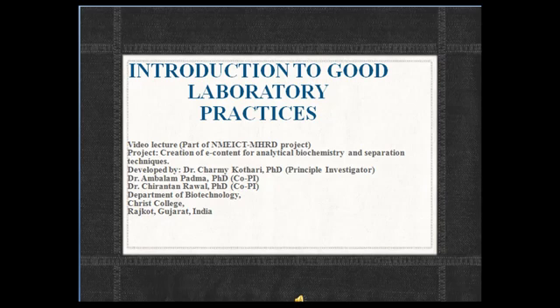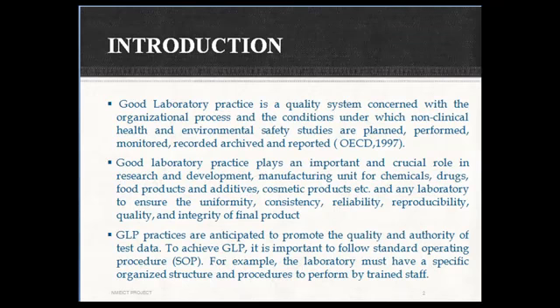Introduction to good laboratory practice. Good laboratory practice is a quality system concerned with organizational process and the conditions under which non-clinical health and environmental safety studies are planned, performed, monitored, recorded, archived, and reported. Good laboratory practice plays an important and crucial role in research and development.